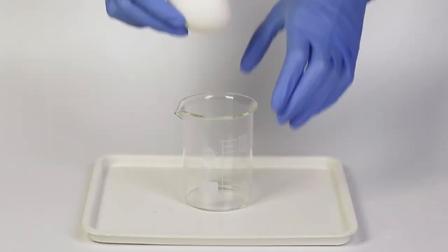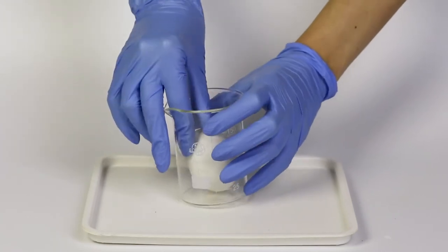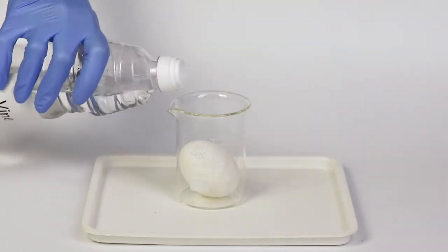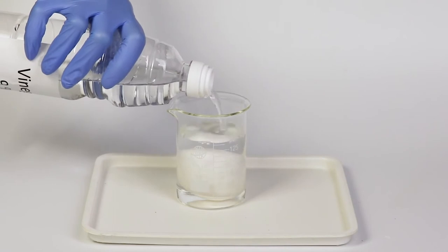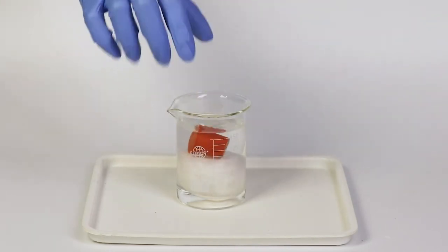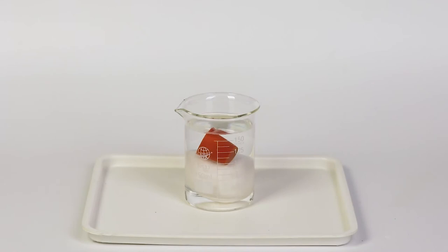Take a beaker and carefully put an egg into it. Cover the egg with the 5 to 10% vinegar solution. Put a rubber stopper onto the egg to prevent it from floating. Wait for 12 hours.